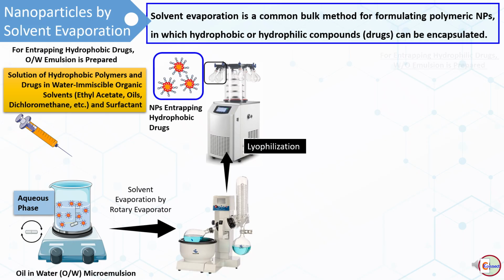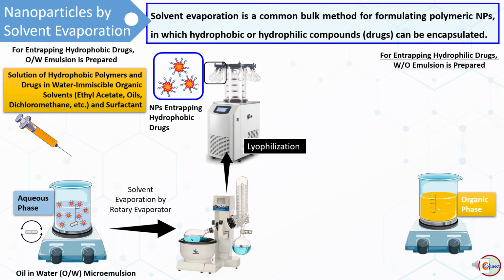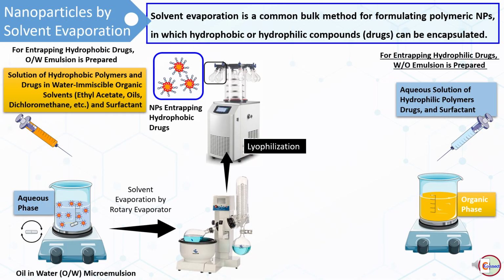In another case, for encapsulation of hydrophilic drugs, a water-in-oil emulsion is prepared. For this, the organic phase or non-aqueous phase is placed in a container, and the aqueous phase containing hydrophilic polymers, drugs, and a suitable surfactant is added to it dropwise while stirring vigorously.